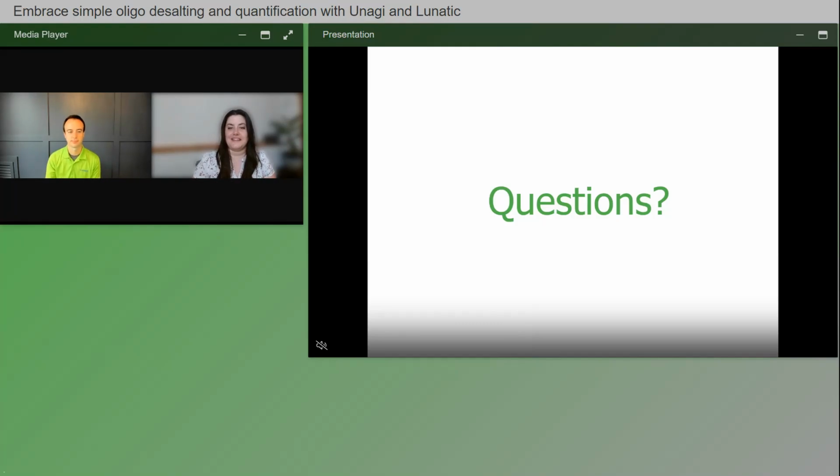All right, excellent. And it looks like we have one more question here today. This last one is asking, how long can samples be held in the SBS plate prior to read on the Lunatic instrument? So about 2 hours, and that's before you're putting it into the Lunatic. That's our typical guidance. Usually that comes in handy when you're loading a lot of samples, maybe in an automation setup prior to reading. But the idea is that the small sample volume is secured within the Lunatic plate and sheltered from evaporation during those 2 hours.